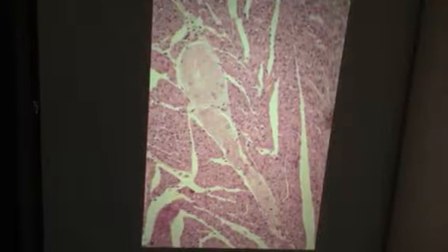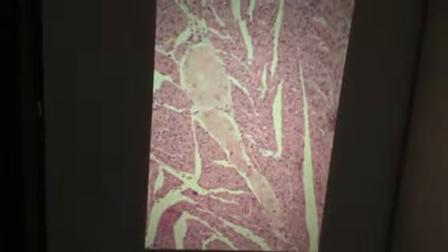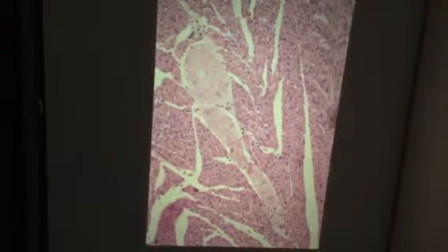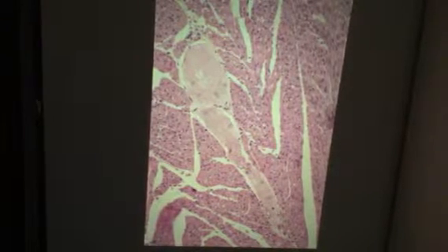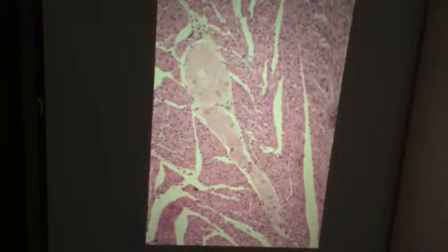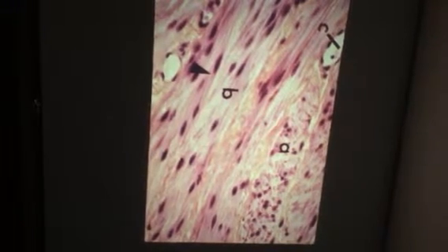And how about this thing right here? What structure do we see right there? Purkinje fibers. Not Purkinje cells, but Purkinje fibers. And how about this tissue? Smooth muscle. And we know that's smooth muscle because we have these nice stogie-shaped nuclei, and kind of a spindle-shaped cell.